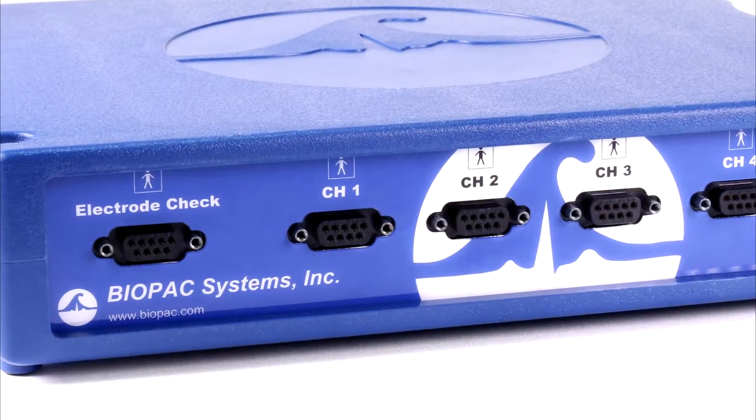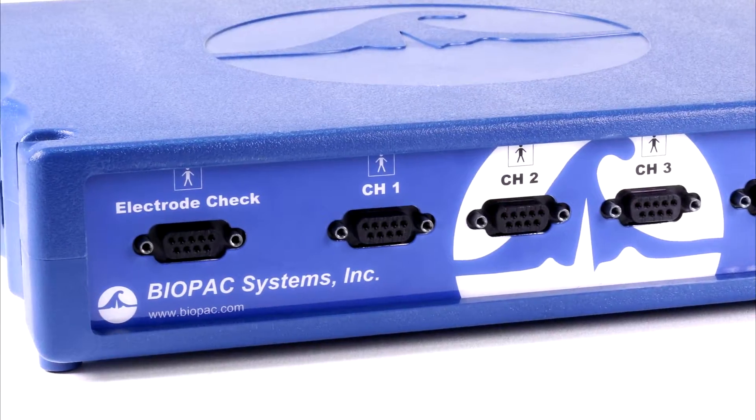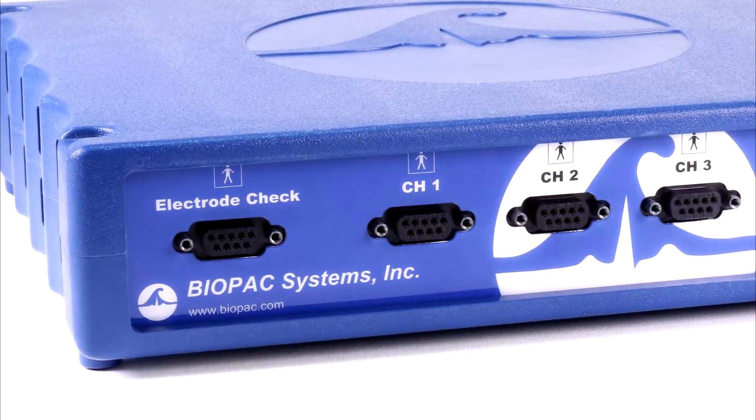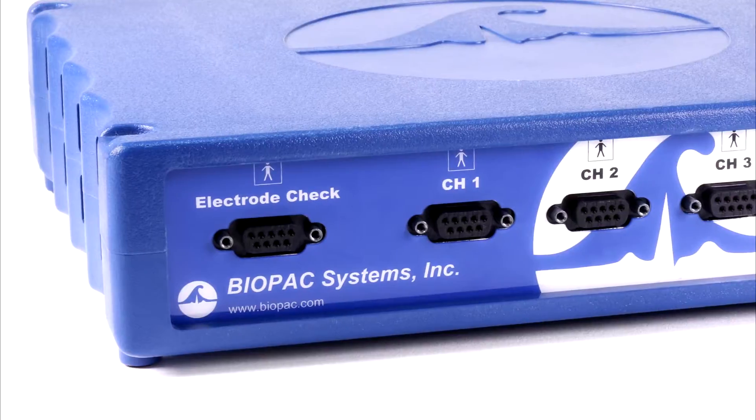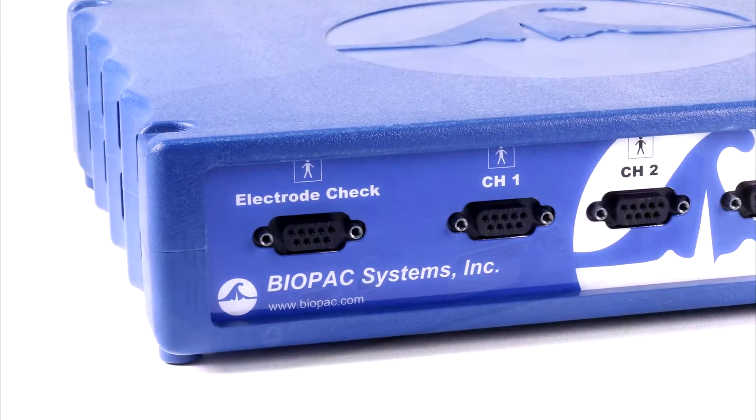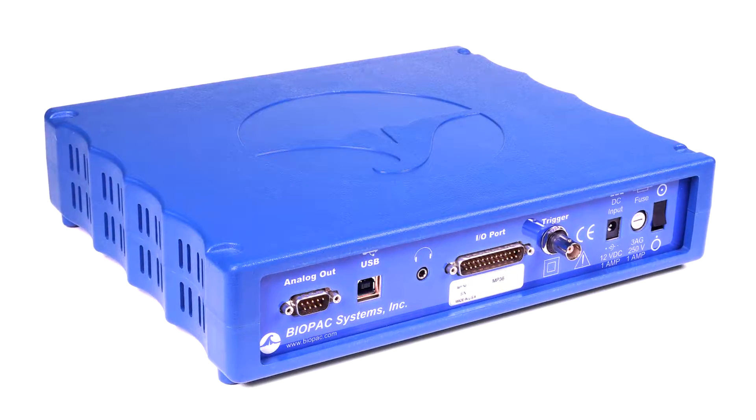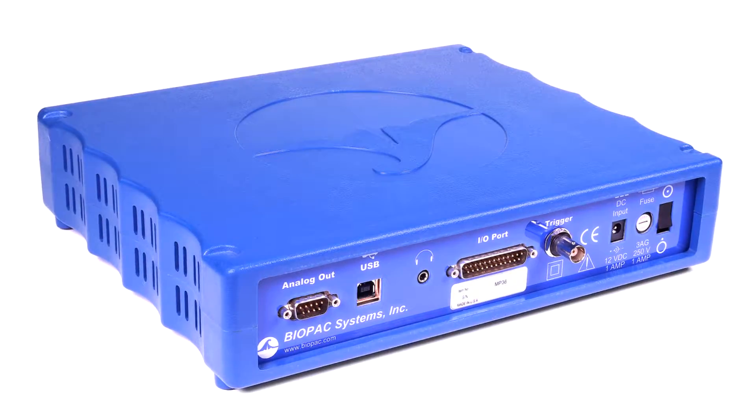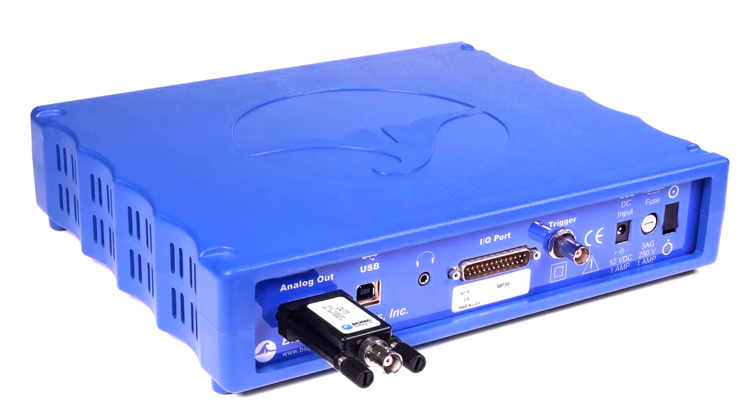transducers, I.O. devices, and stimulation. The electrode checker confirms signal quality before recording begins to help students collect good data. The MP36 also has a built-in low voltage stimulator for animal studies accessible by adding the OUT3 stimulator output adapter.